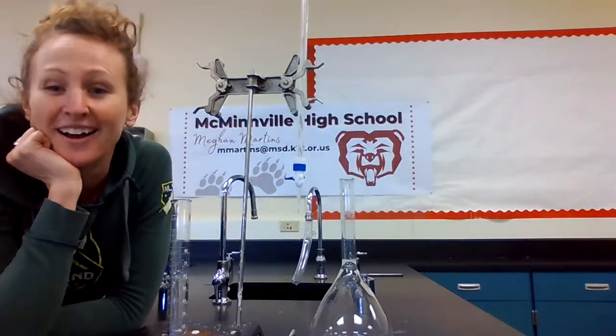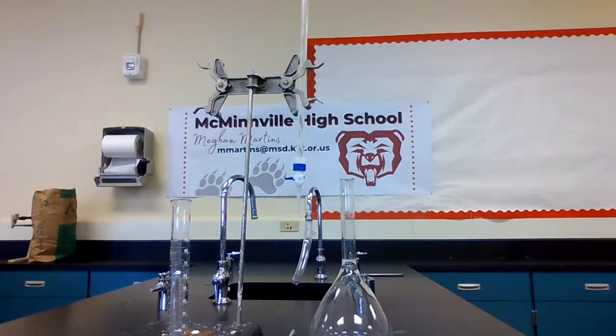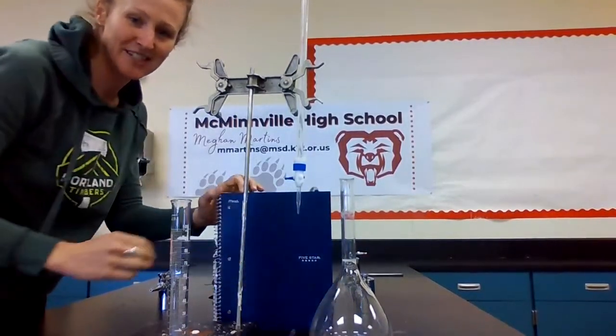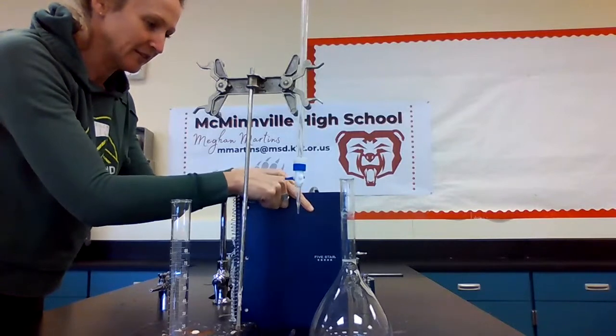Okay, so another good place to pause the video and think for 30 seconds, can you list off what all 4 pieces of glassware should be used for? Okay, so let's go through them. I'm going to set up a little background here so you can just see the glassware a little bit better. This is my very official dark background.